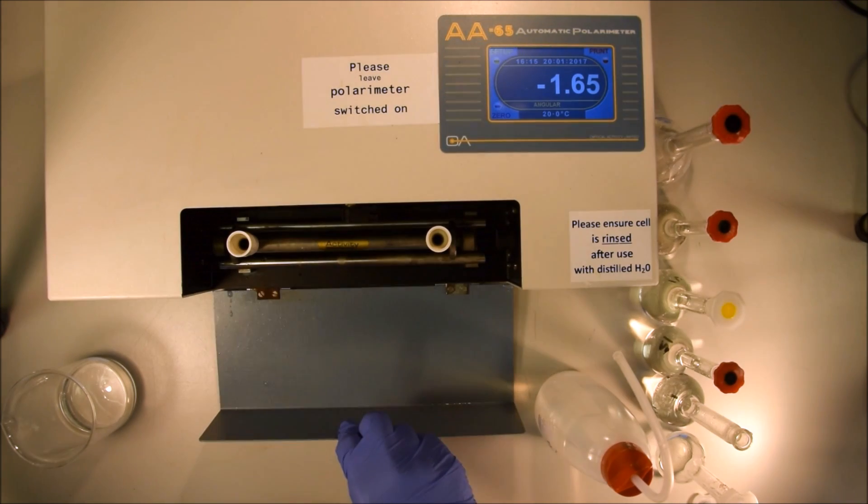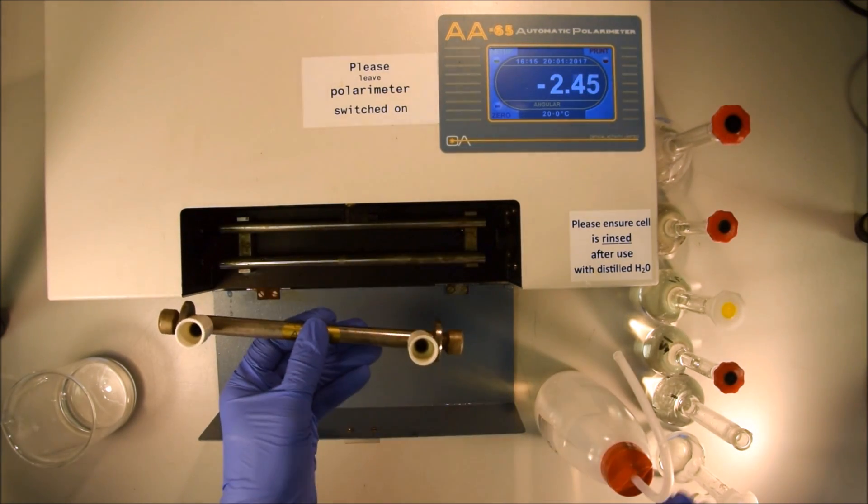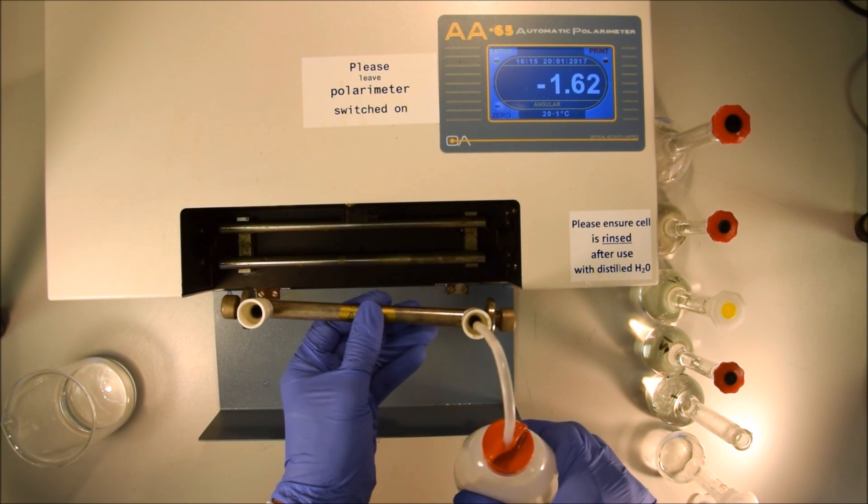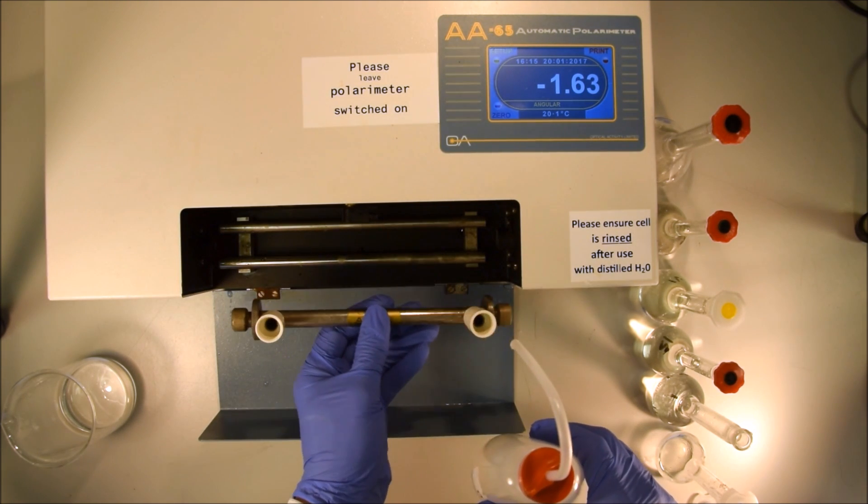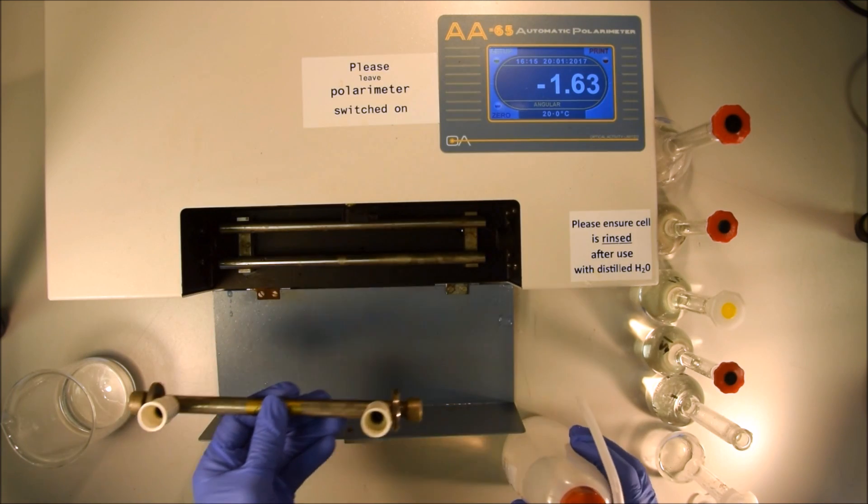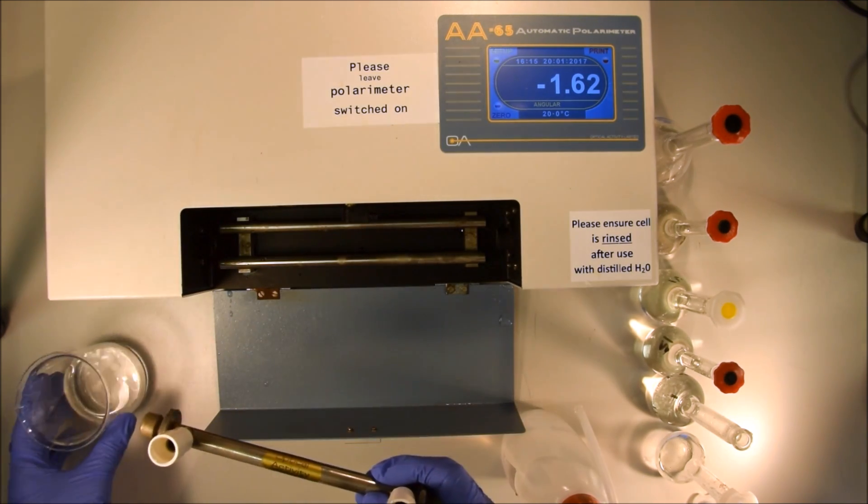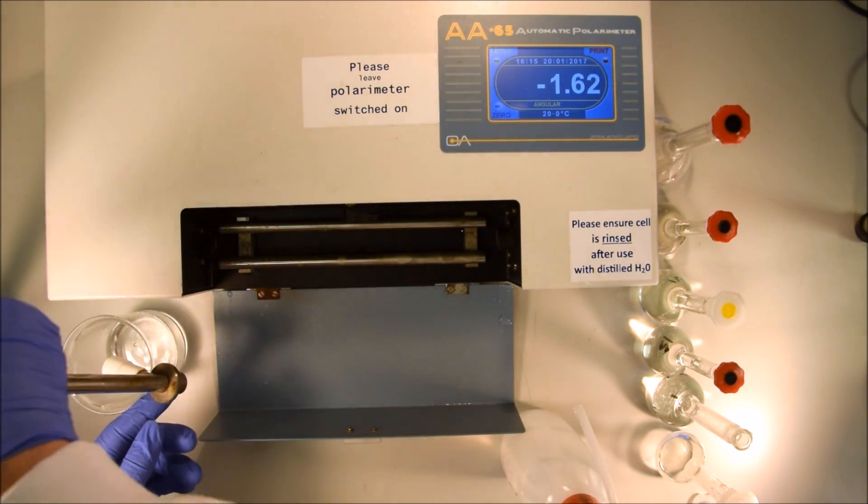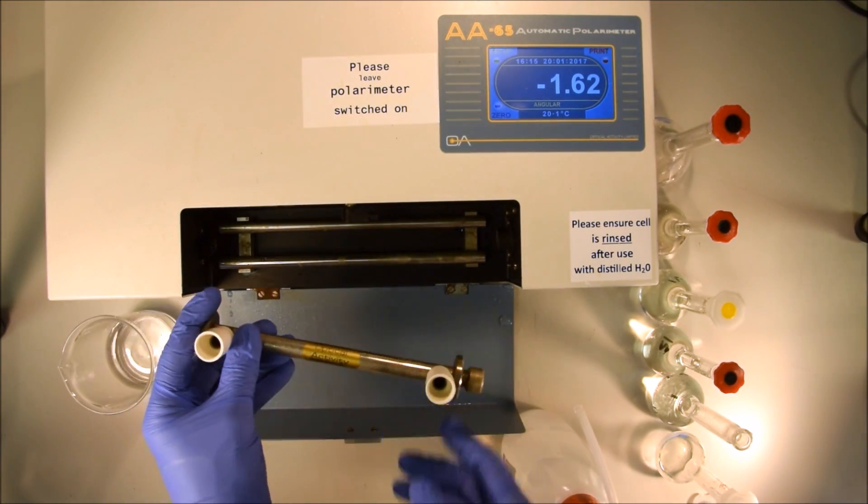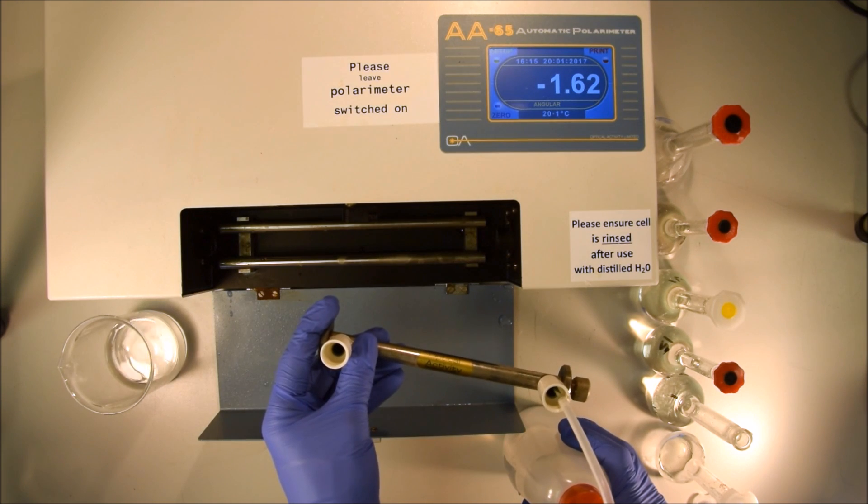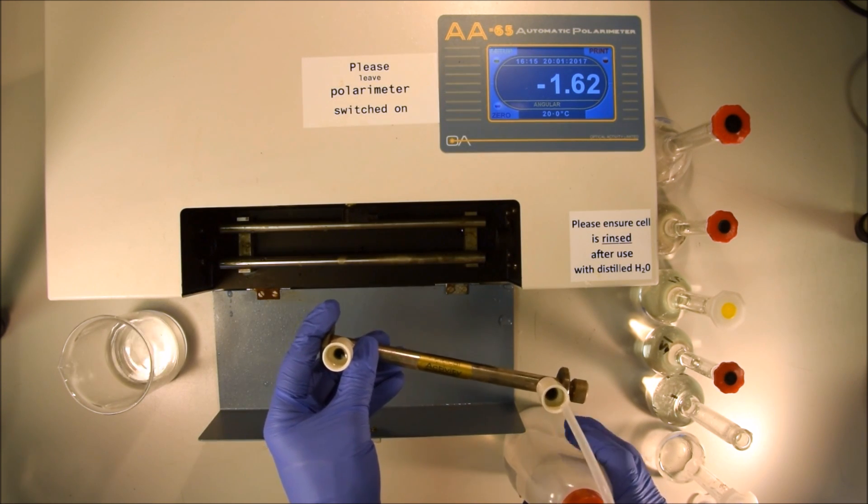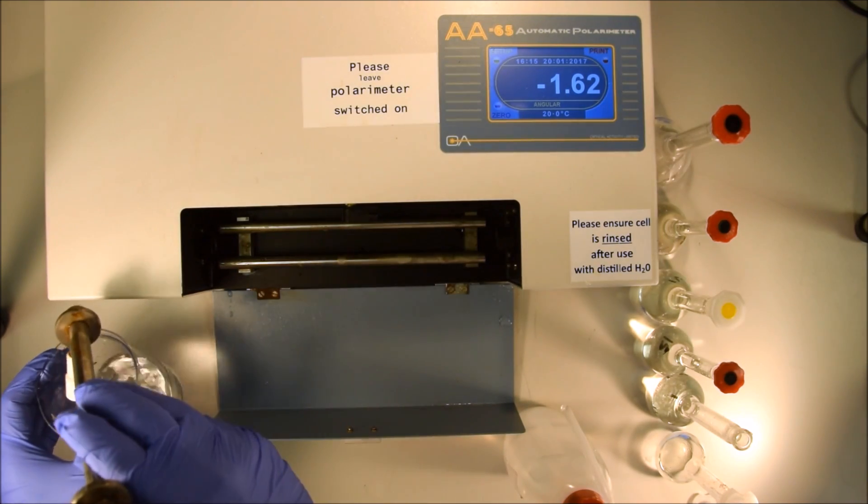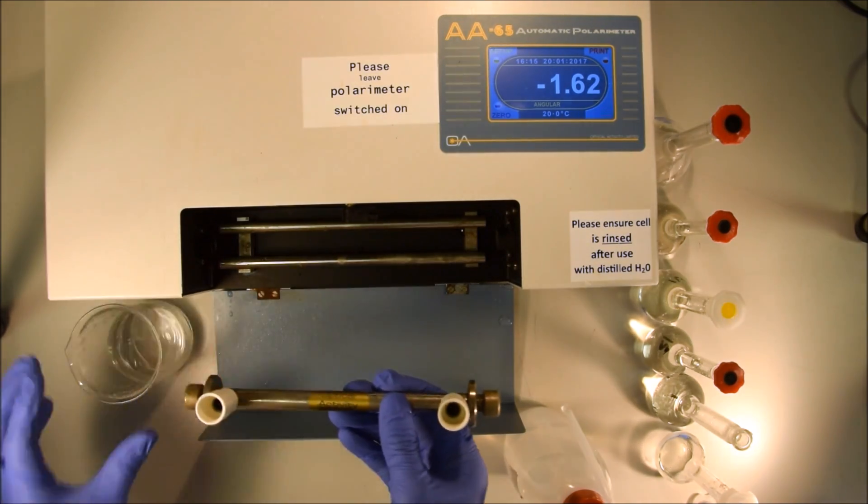Now we're on to making our measurements. This is a polarimeter and inside the polarimeter is a cell. The cell is a tube with an open end at either side. The first thing we want to do is clean it out. You can put in water in one end and it'll come out the other end. You have to be a little bit careful when pouring stuff into it because if you overfill it, it'll go in one end and out the other and make a mess.